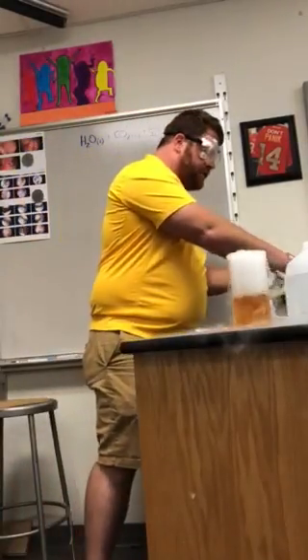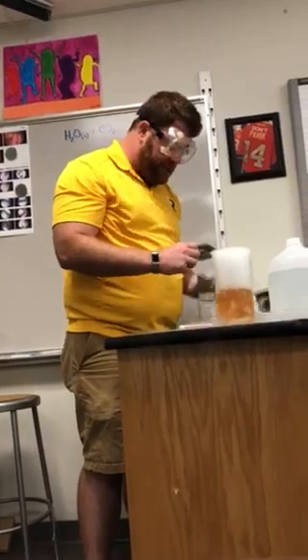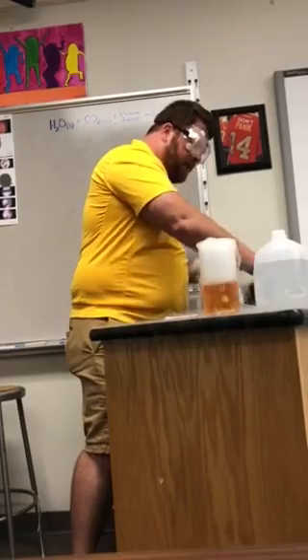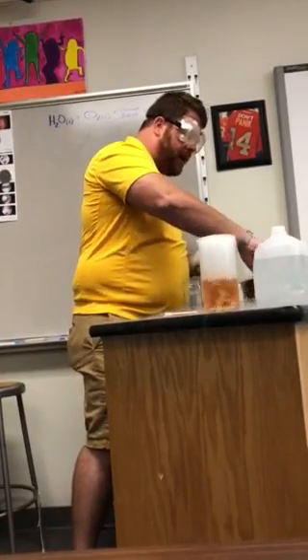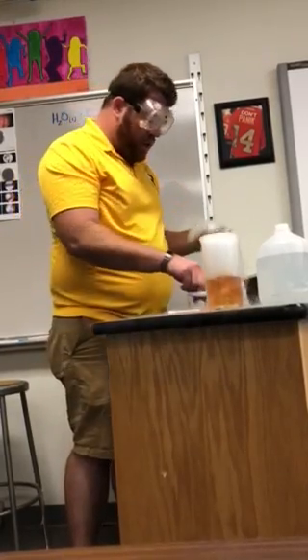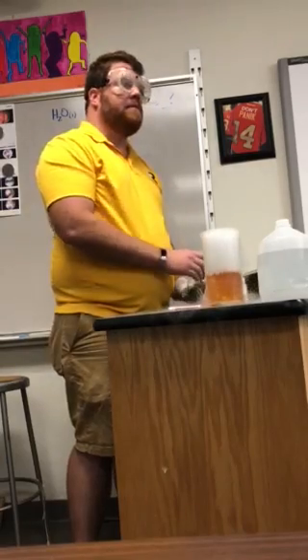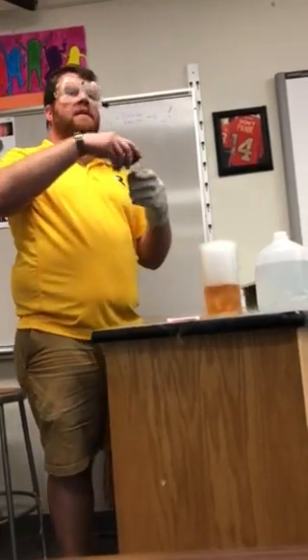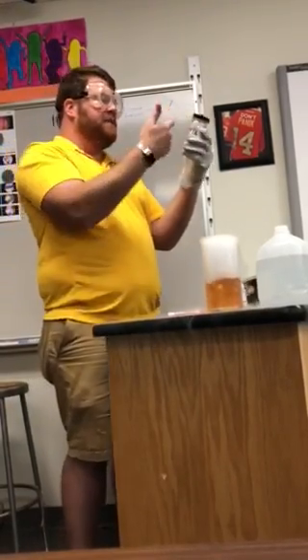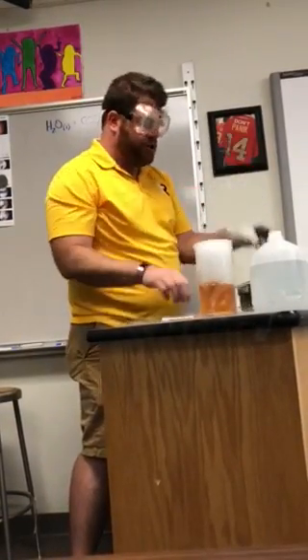The next thing that I want to show you is using magnesium shavings. And magnesium reacts with oxygen, but we can actually cause this reaction to occur a lot quicker if, for example, we put it under a flame, okay? This is why we actually have to have magnesium in a sealed jar, because it will still react with the oxygen when I open this container up, and that's why it looks tarnished right now.